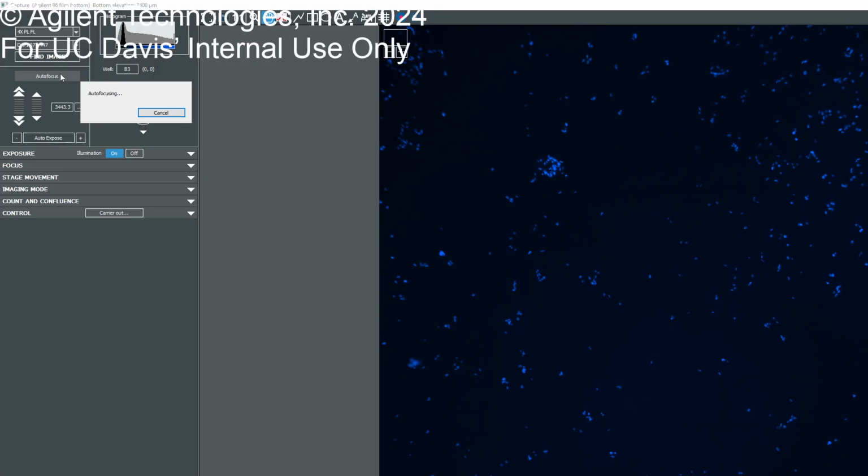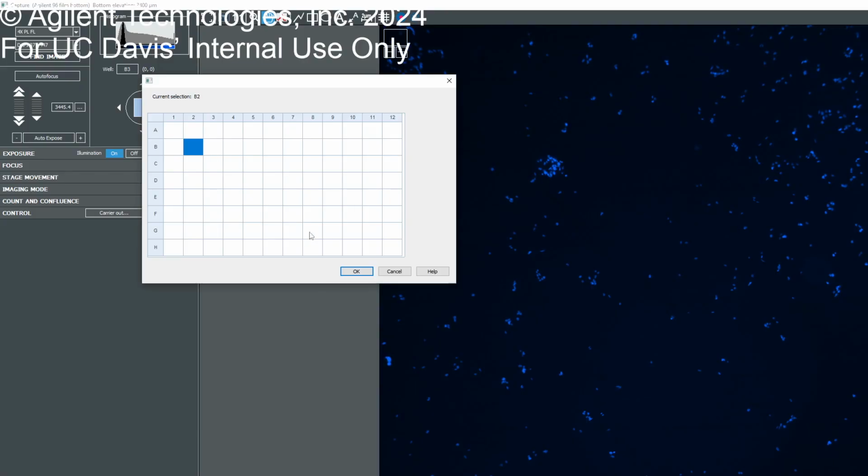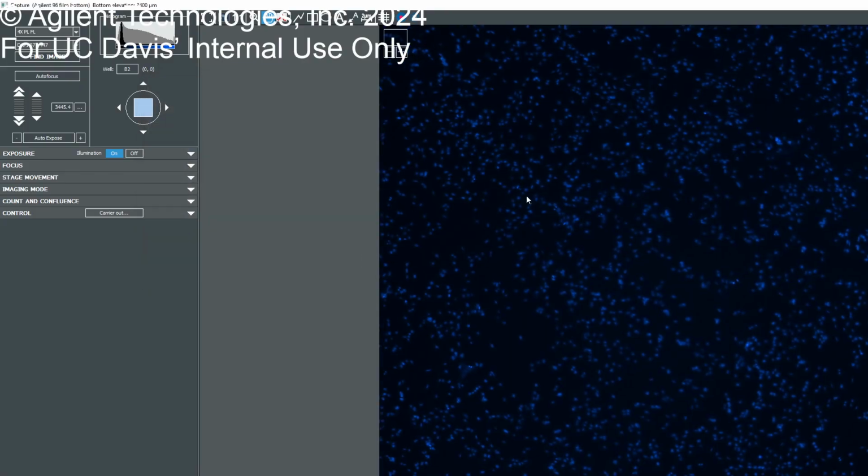It looks pretty much the same, right? Because it's a very old plate. This is just a demo plate to test out the functions of the imaging. It's not really to image a sample. It's just to show you the functionality of it. So maybe we can jump here and just click auto expose and then autofocus. And it improved it slightly.